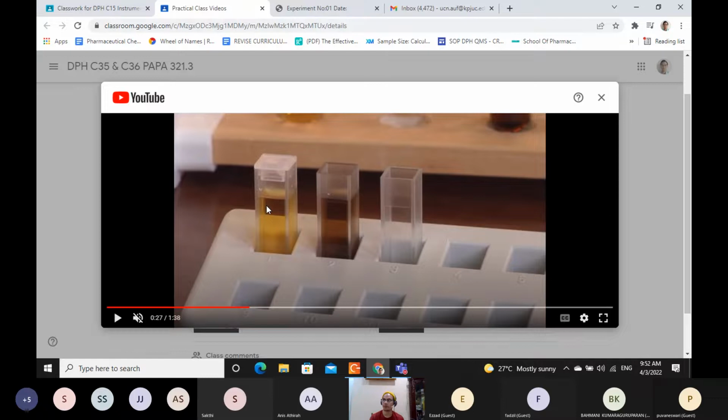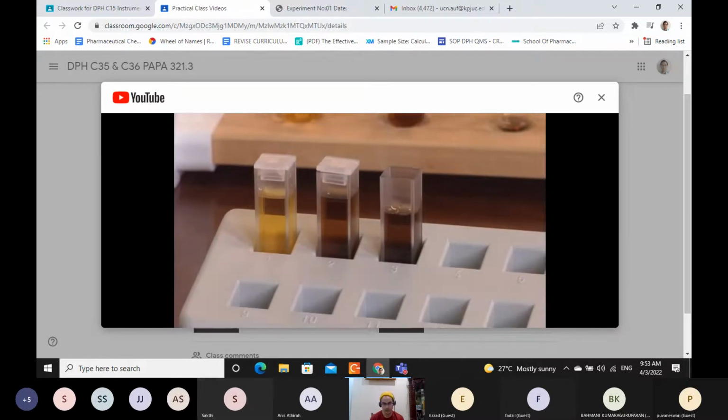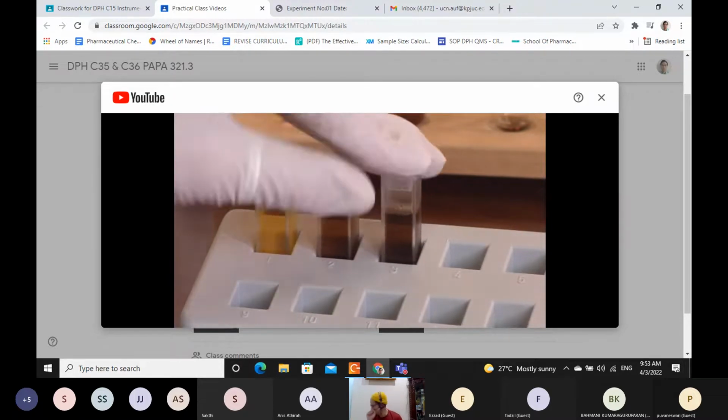The cuvette is either made from the cheap material macam glass, silica, the mahal ones are quartz, crystal, tapi janji the clear. Okay, it's a clear surface so that the light radiation can pass through our solution. Okay, kita nak make sure kita punya solution ni boleh menyerap cahaya. So this is called a cuvette. We fill in the cuvette with our test solution, and then we will put the cuvette into our spectrophotometer.